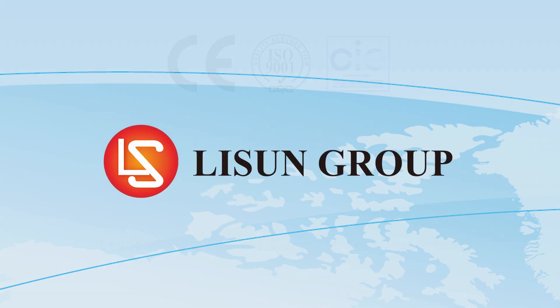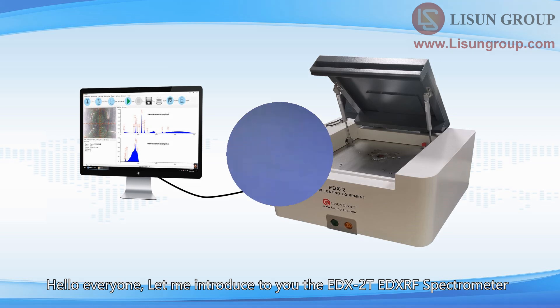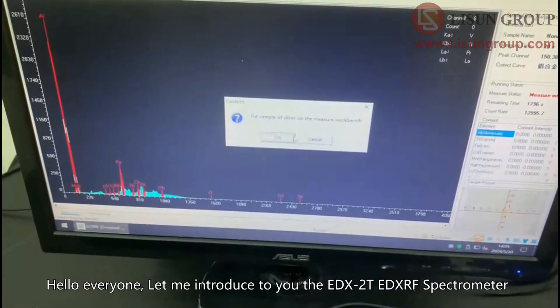Lassun is a leader in lighting and electrical test instruments. Hello everyone, let me introduce to you the EDX2T EDXRF spectrometer.